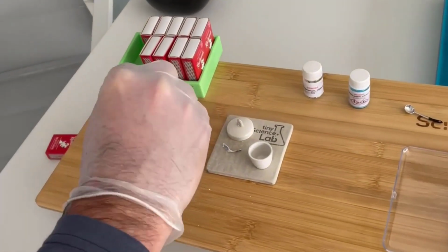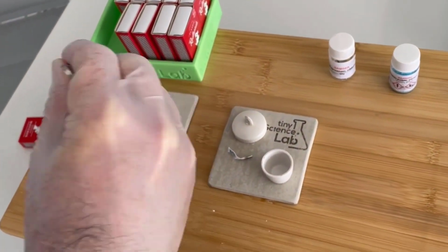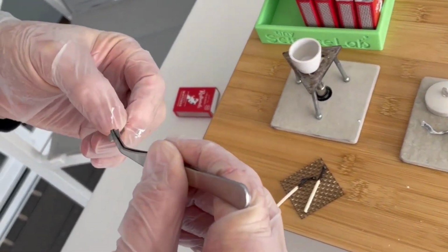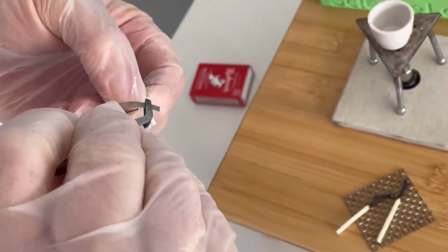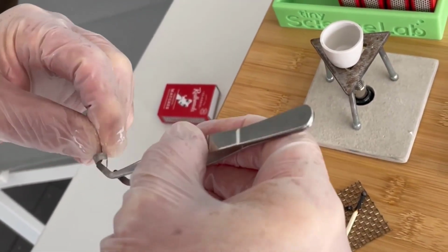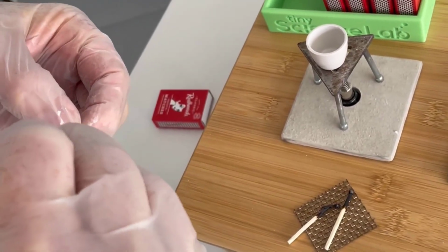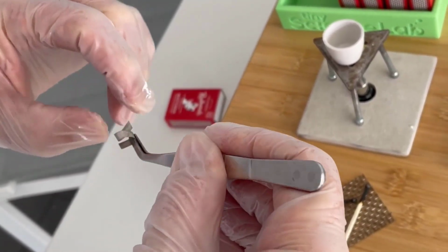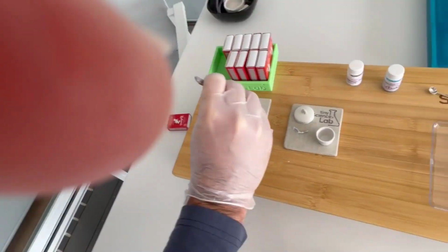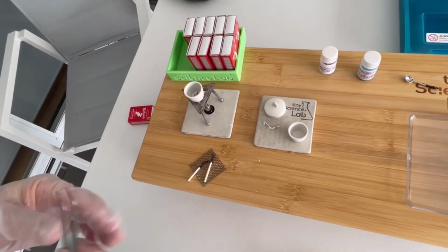I'm actually going to just ensure all of the magnesium is in there. So to do that, I'm just going to twist my magnesium a little bit. So I want to try, if I can, to get all of my magnesium to react. I'm going to put my magnesium in there.